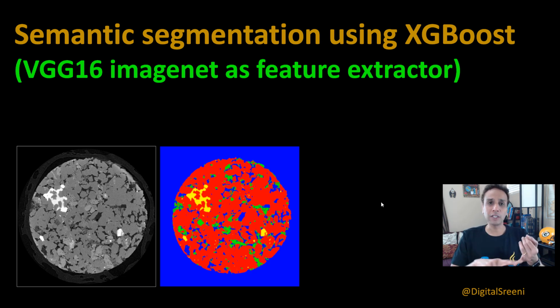You can use Gabor filters, you can use Gaussian smoothing, edge detection, and a whole bunch of filters, and you can put together your own features if you can engineer them. Or you can use features from a pre-configured network. So that's exactly what we're going to do here. We're going to take the VGG16 architecture. This is our deep learning, right? So now I'm trying to mix deep learning plus our XGBoost here, best of both worlds.